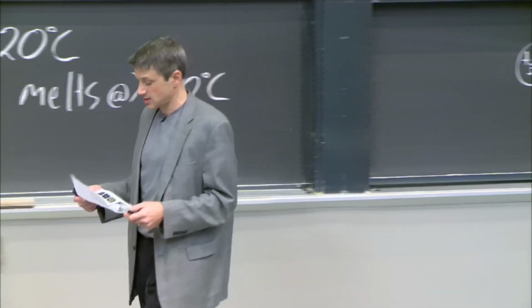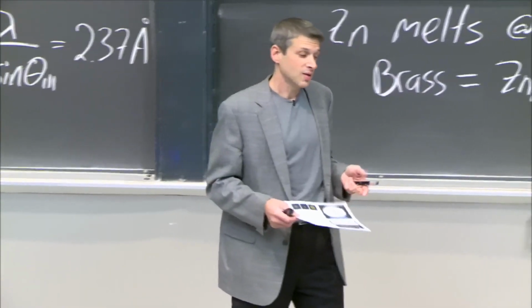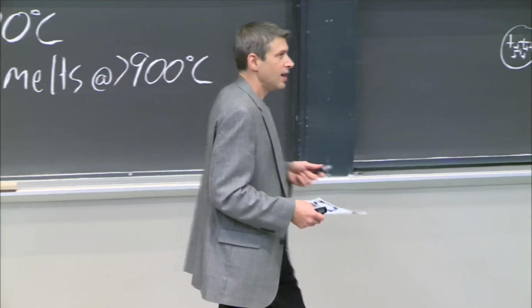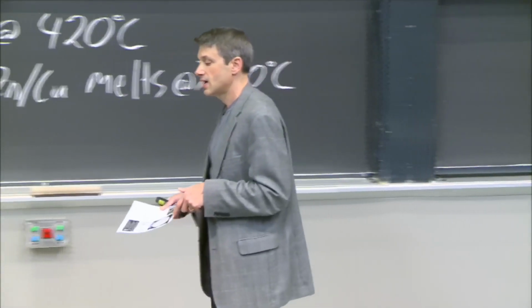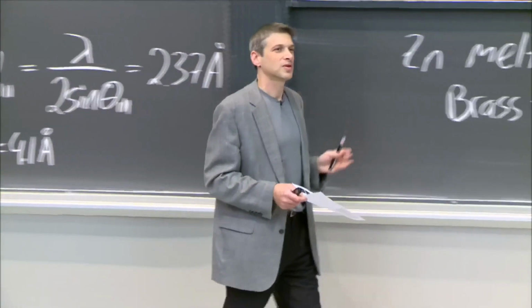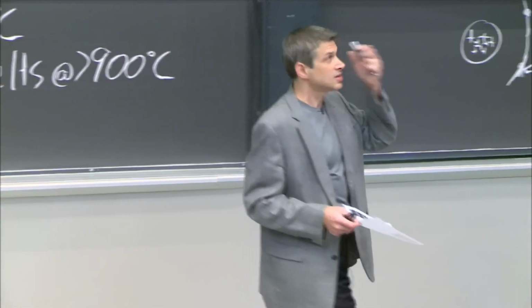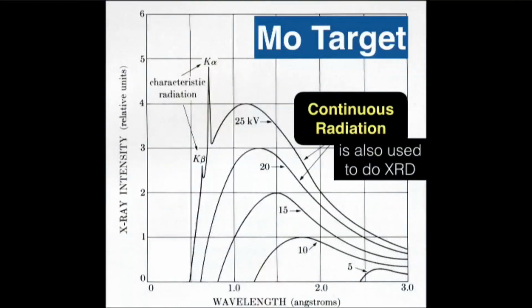Sharing is always caring. Now, there's another type of X-ray I want to talk about, and actually, this is much less used today. I hope you've gotten a sense of how powerful these characteristic X-rays are. You know exactly what the wavelength is. But in the very earliest XRD experiments, it was the Bremsstrahlung radiation that was used. And that was by von Laue. So I want to just tell you about that.